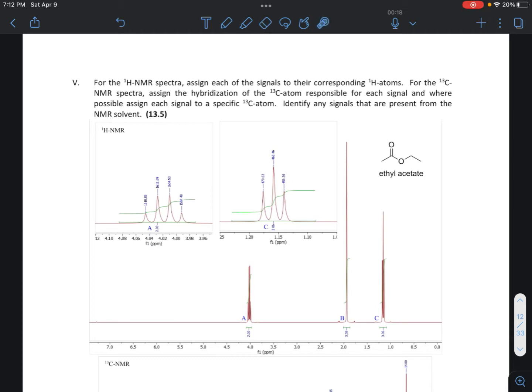For NMR, in order for you to determine the splitting pattern of a particular hydrogen substituted carbon, you want to look at the nearest neighbor. So if we are looking at this CH3 group, we're going to look at this one to determine what the splitting pattern of this will be. Since this carbon doesn't have any hydrogen, this is going to be N+1, which is just 0.